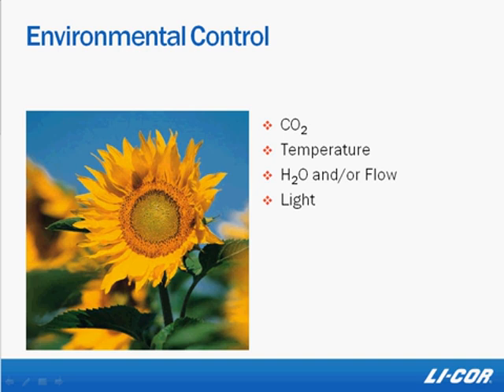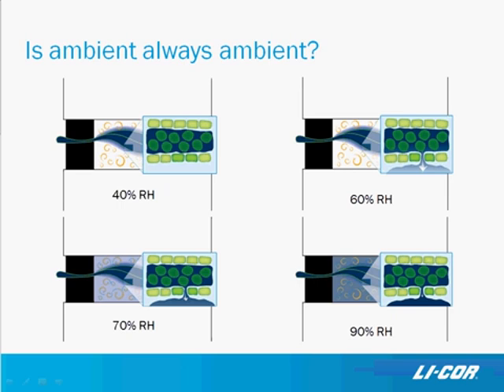But you need to make sure that you keep the leaf at the same plane as your light source, whether that's the sun or a growth chamber's light or something like that, because otherwise you might shade your leaf, and we want to avoid that. Now, I mentioned ambient water. Spot measurements or larger diurnal measurements depend on really working at ambient conditions, so we don't have to wait for it to acclimate to something.